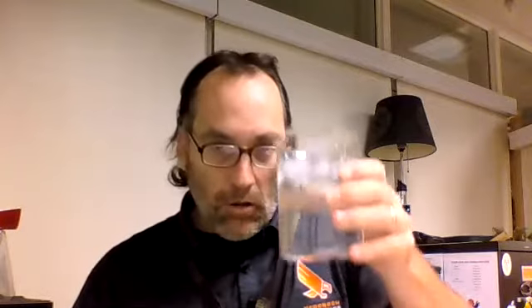Now, the change that I want to take a look at is not the boiling of water. What I'm going to do is I'm going to take that can. It's very hot. I'm going to use the tongs, and I'm going to invert that can into our ice bath. So this is very, very cold, probably around 2 or 3 degrees Celsius. So it's not 0 because otherwise it would be all frozen, but there is some ice at the very top, and our water down below here is very cold. So we have a very hot can, and I'm going to invert it into our beaker, our ice bath.